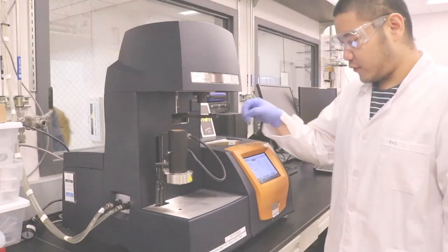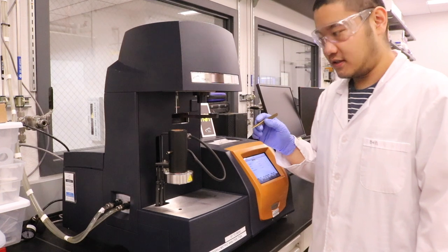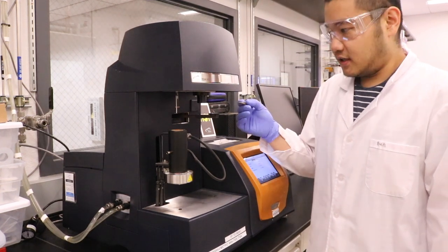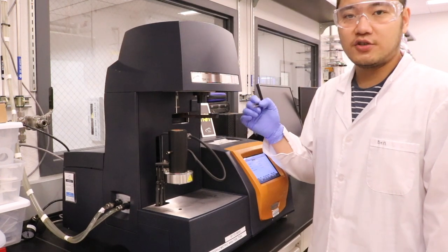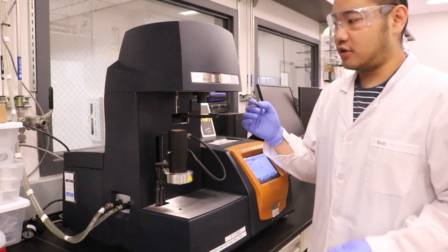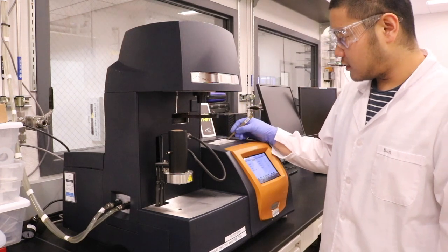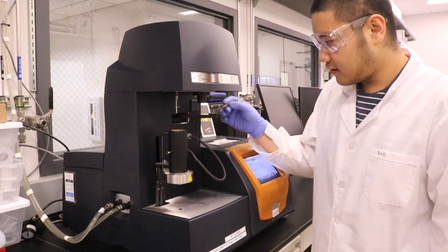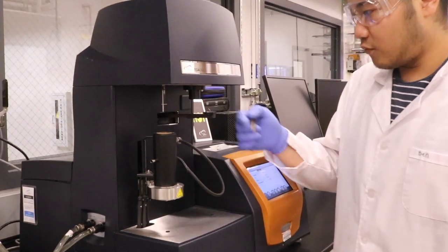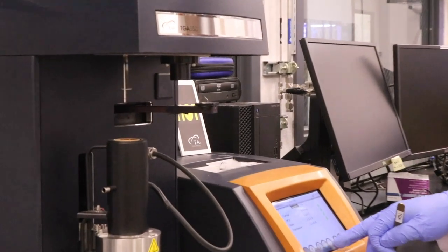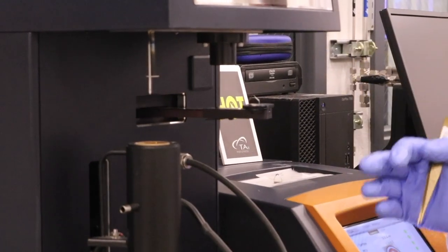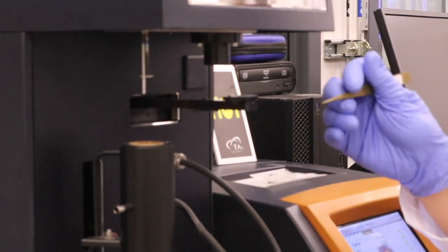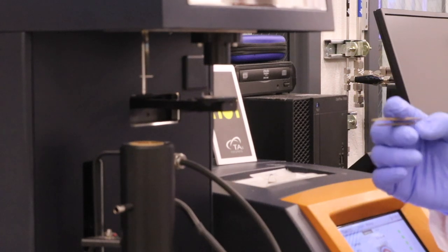So here we have thermogravimetric analysis equipment. What this machine does is it will analyze what composition you have for each nanoparticle polymer composite. We'll first load the sample onto this pan here, and then we will load this pan.